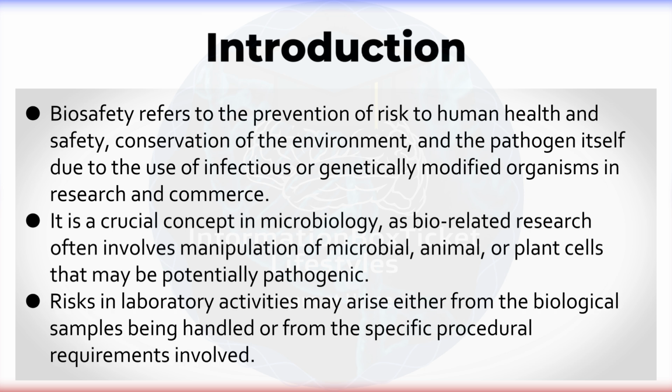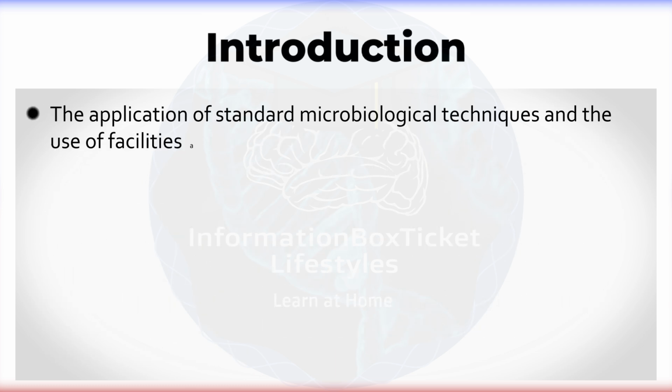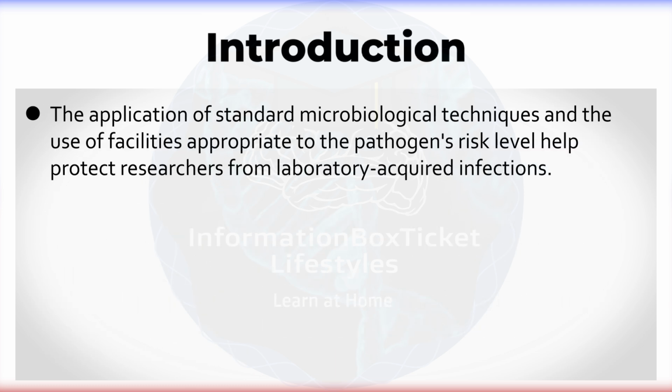Risks in laboratory activities may arise either from the biological samples being handled or from the specific procedural requirements involved. The application of standard microbiological techniques and the use of facilities appropriate to the pathogen's risk level help protect researchers from laboratory-acquired infections.